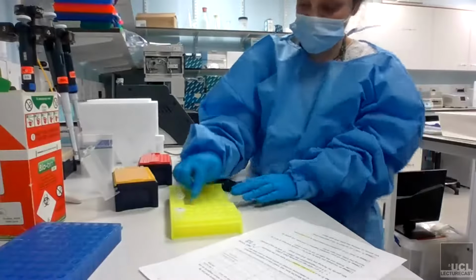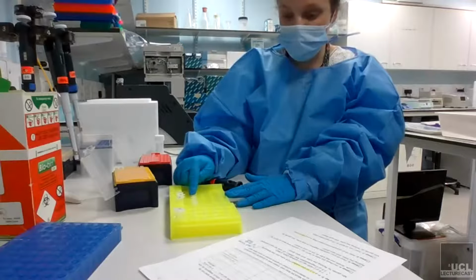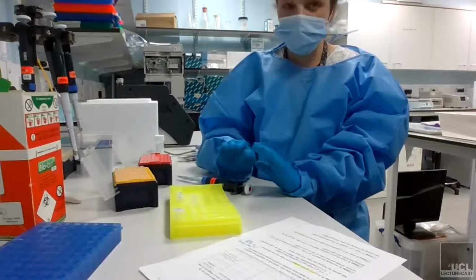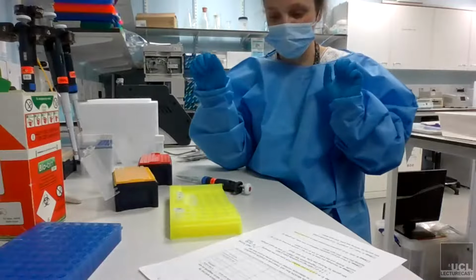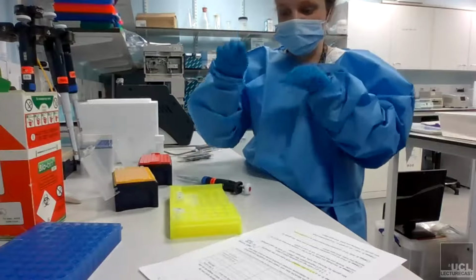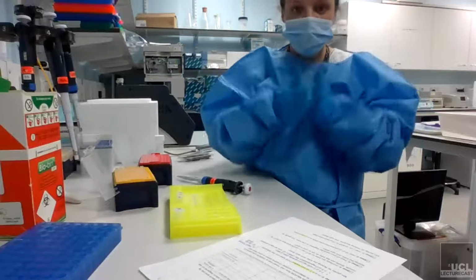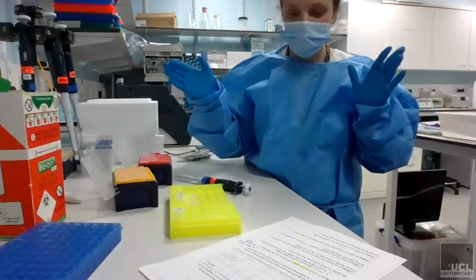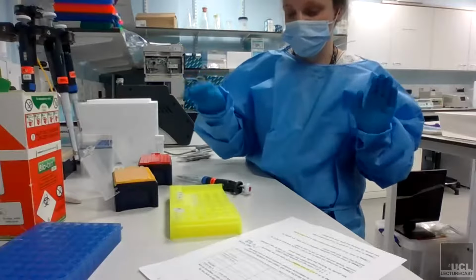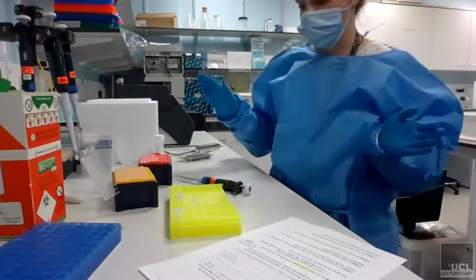So now in each of our tubes, we've got approximately 400 nanograms of each of our samples. And hopefully they will all be at least 30 kb in terms of size. It doesn't matter so much if they're above it, but if you have a lot of samples, I found that it's best to try and make sure they're all roughly the same size as well, because otherwise you get some barcodes that will sequence more than others. So if you want to get a nice even coverage, it's best to try and make the samples as equal as possible. I've been experimenting with the idea of normalizing them in terms of femtomoles rather than nanograms per microliter and sizes. So yes, it's important to try and get them as equal as possible so that you get even sequencing across all of the samples.